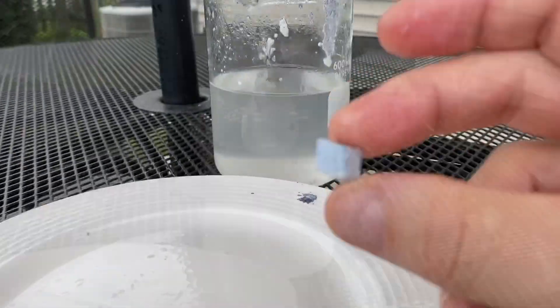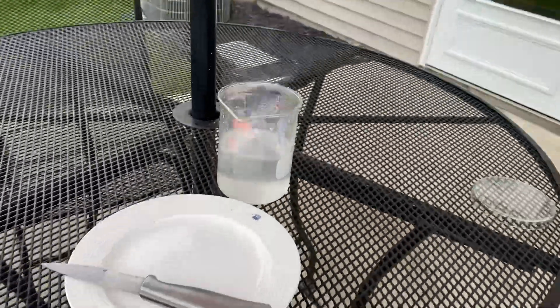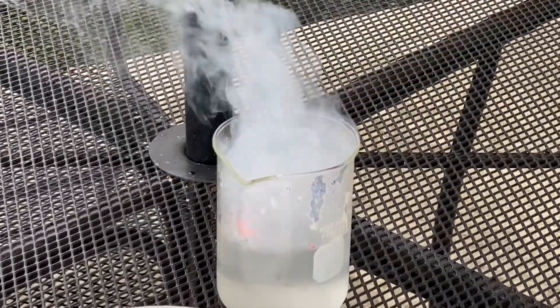Here's another piece of potassium that we're gonna test in water. Check out this exothermic reaction. Amazing.